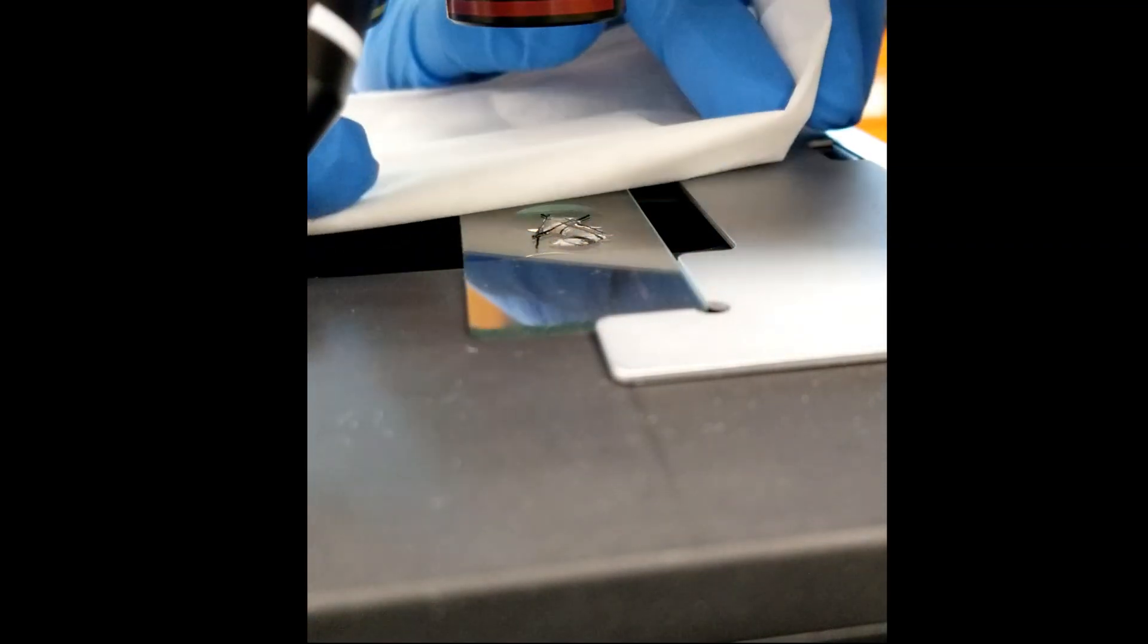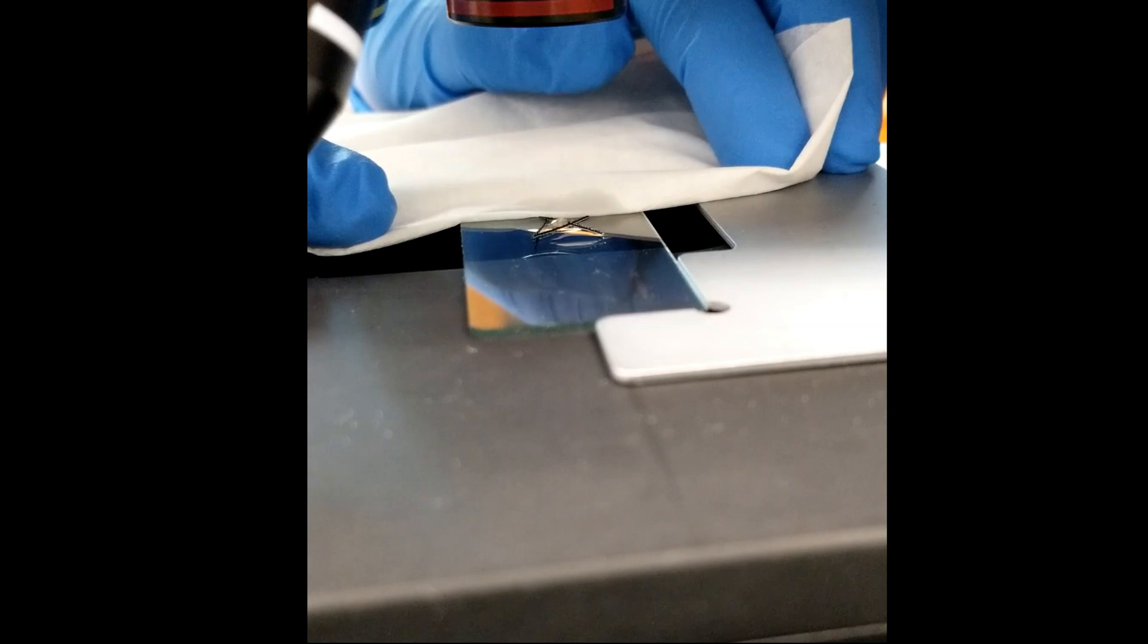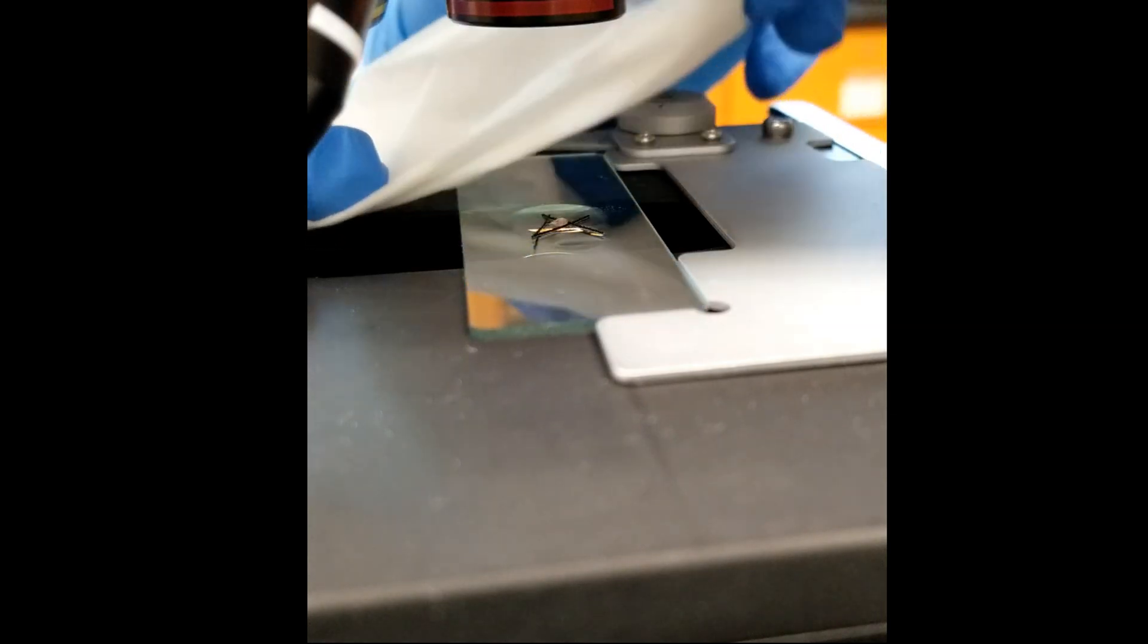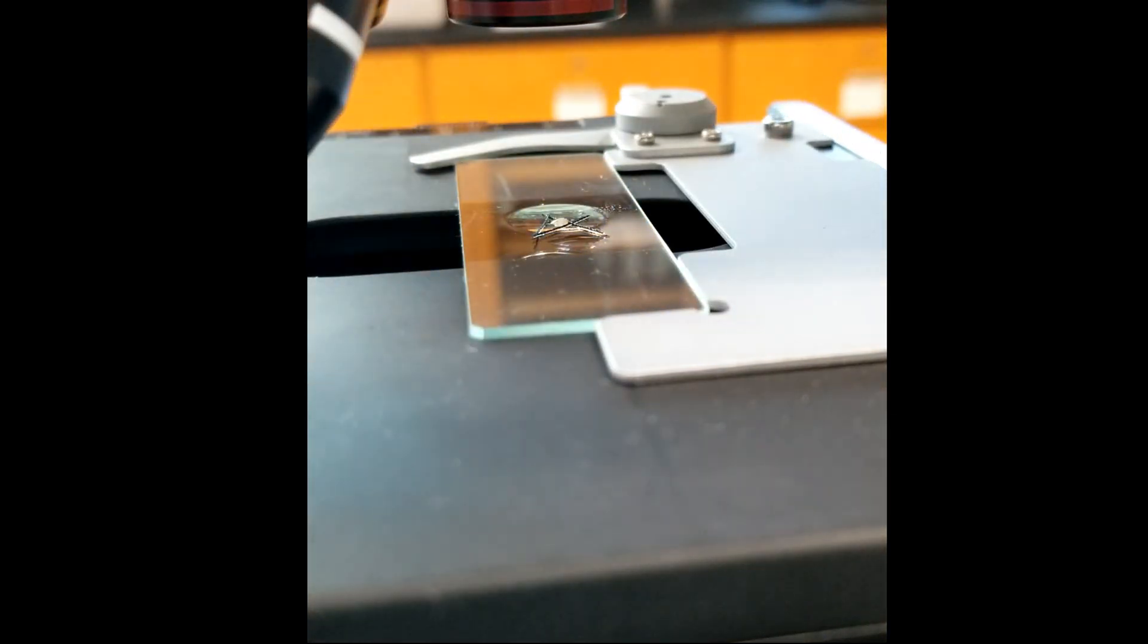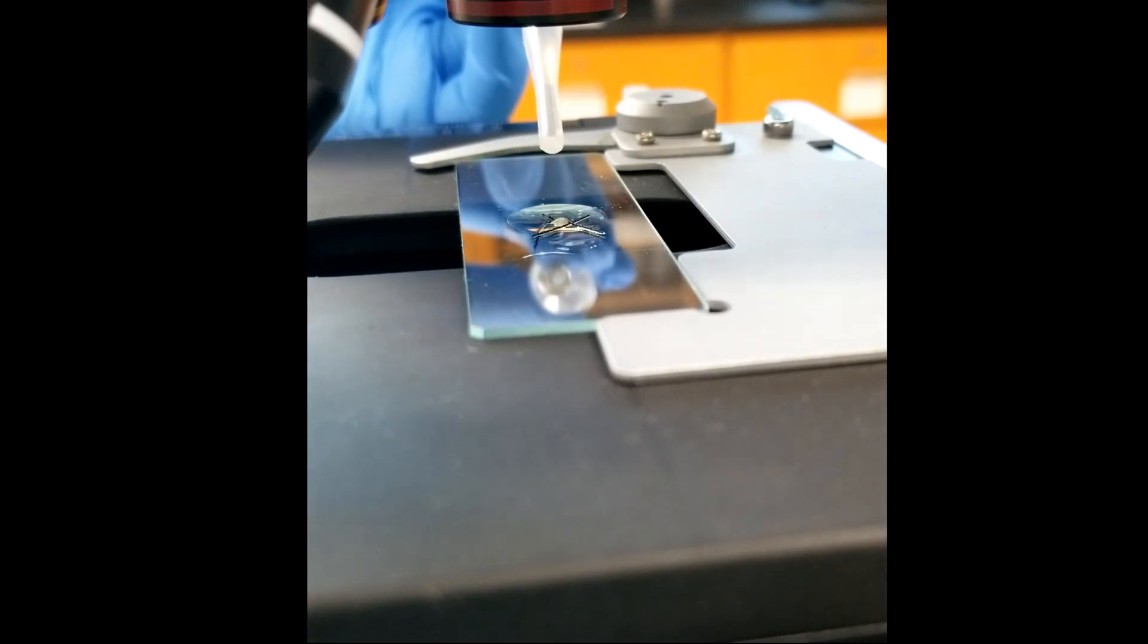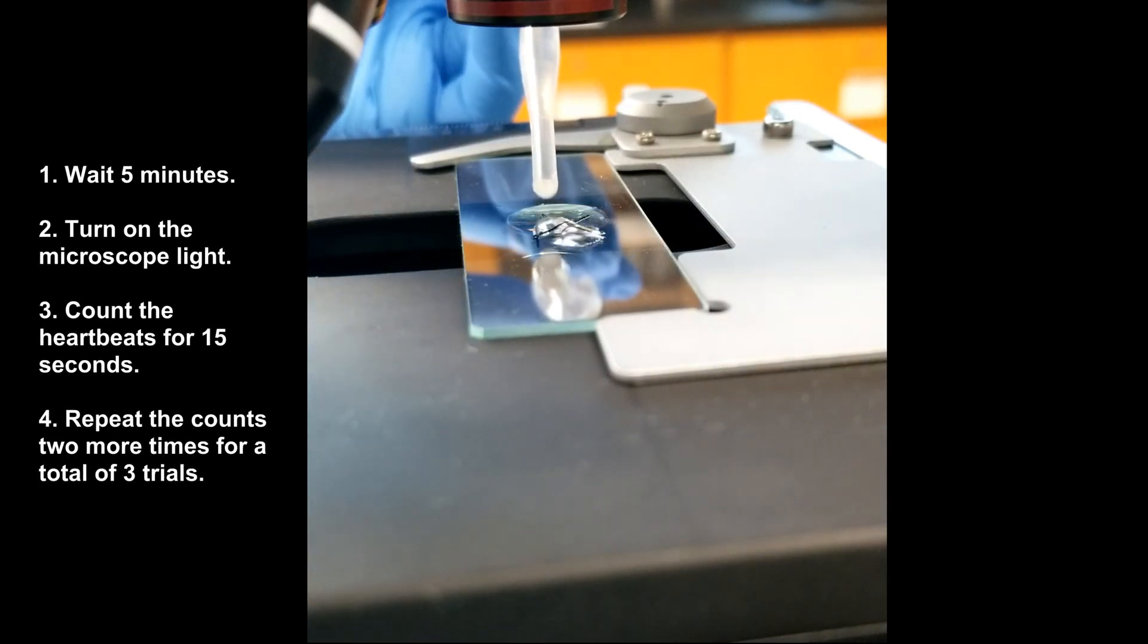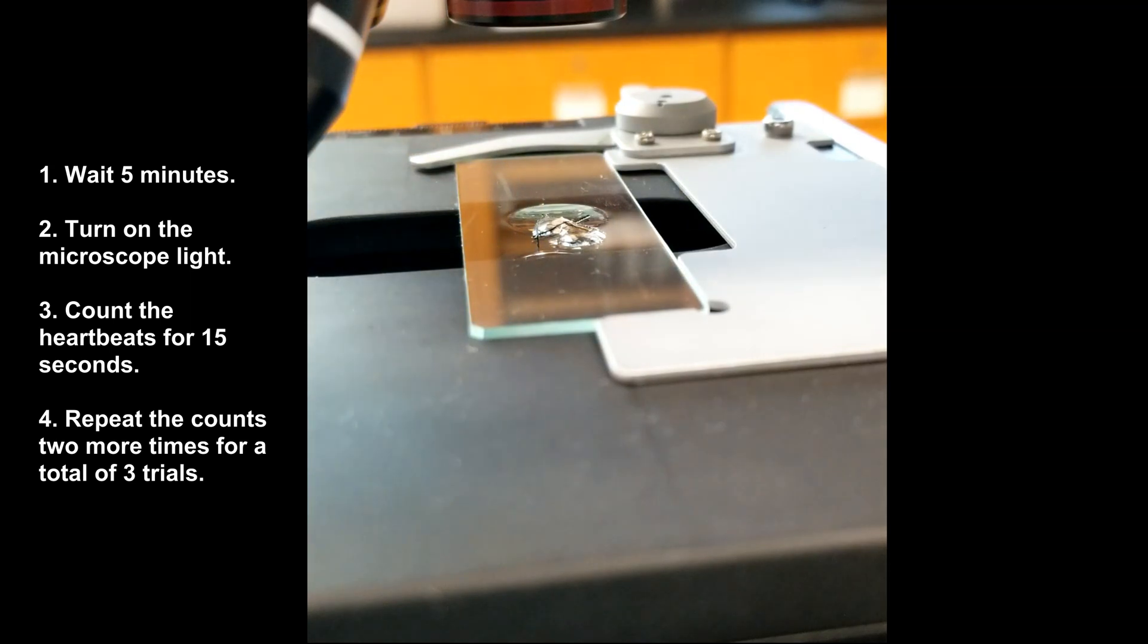To remove the water from around your Daphnia, place a tissue at the edge of the droplet to absorb the water. Be careful not to touch the Daphnia with the tissue as the Daphnia may stick to the tissue or get damaged by it. Immediately add a drop of your test solution to the Daphnia. Ensure that the Daphnia is immersed in the new solution. Wait five minutes, then turn on the microscope and count the heartbeats for 15 seconds three times.